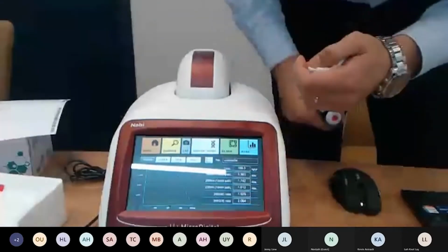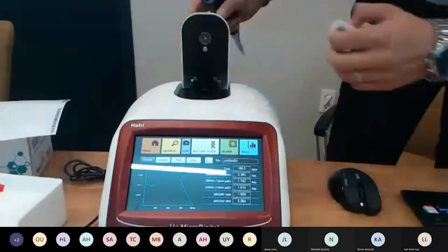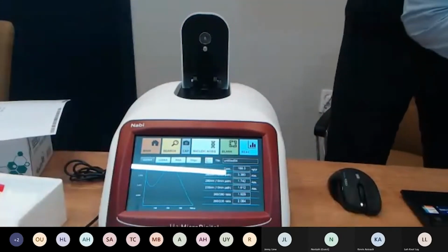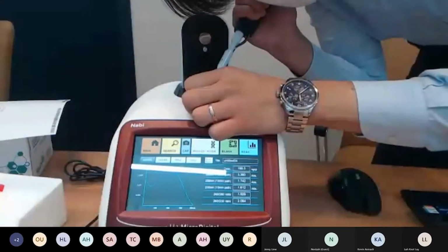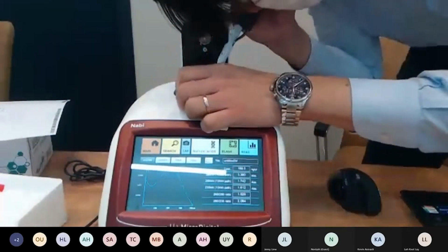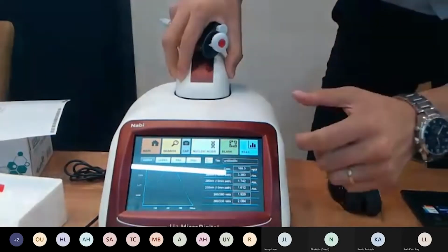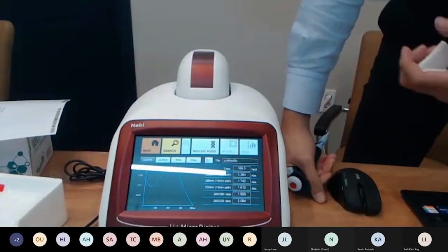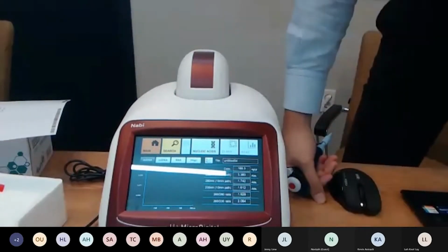So when you heard the measurements going, you probably heard one bleep. So I'll let you listen to it once again. One second. So that's the sound of the motor moving and one measurement.